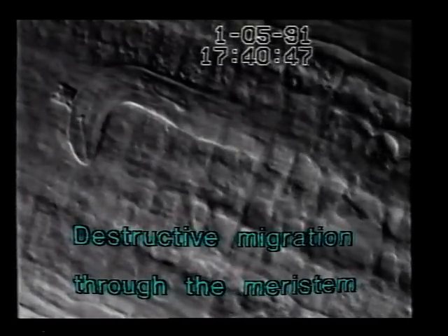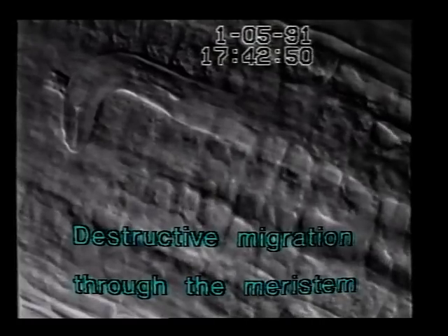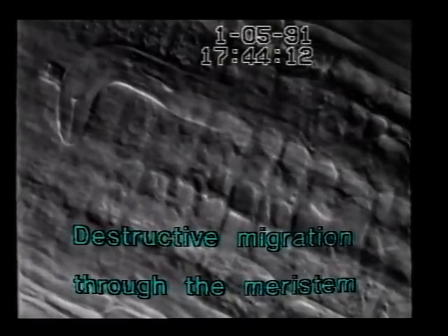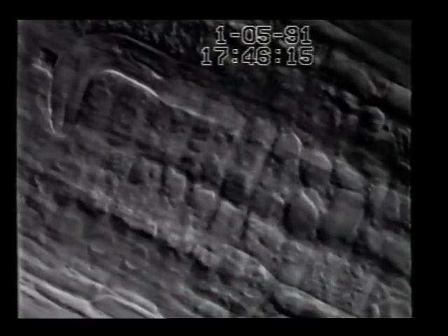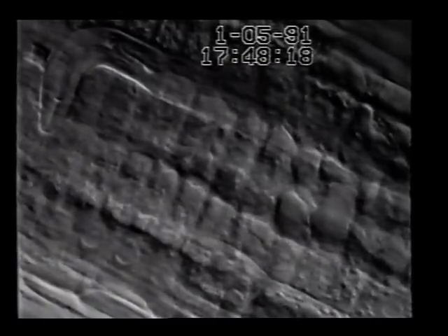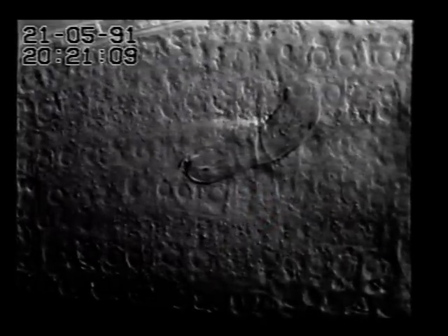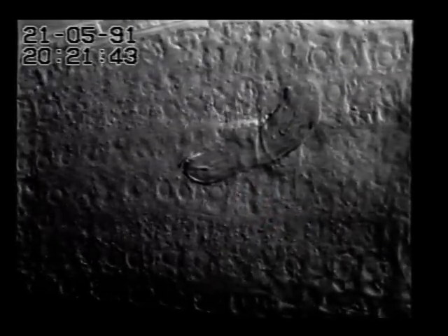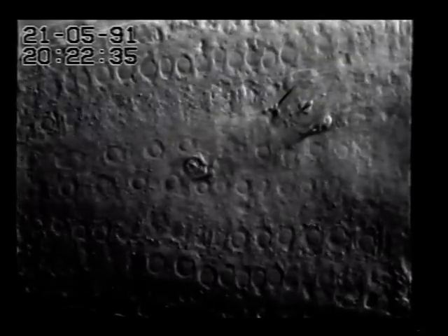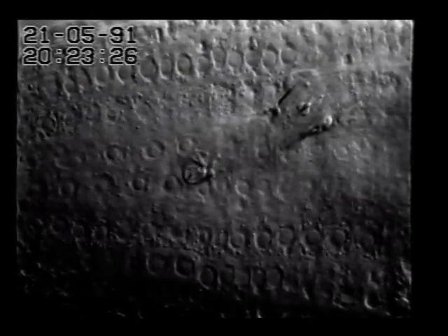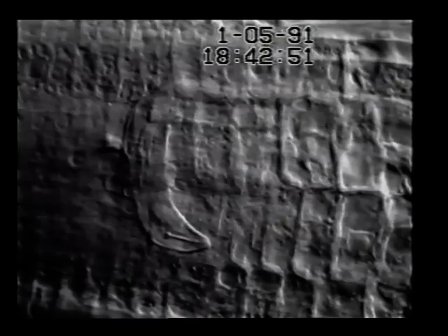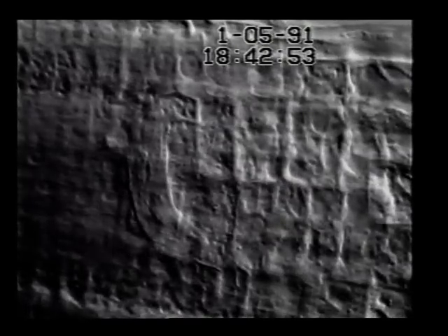During migration through the meristem, a considerable number of the delicate cells is damaged. Afterwards, the path of the nematode is visible by a trace of necrotic cells. The growth of the root tip is usually retarded for some time. The meristematic cells are not damaged by stylet thrusting; the nematode obviously weakens the walls and then crushes them.